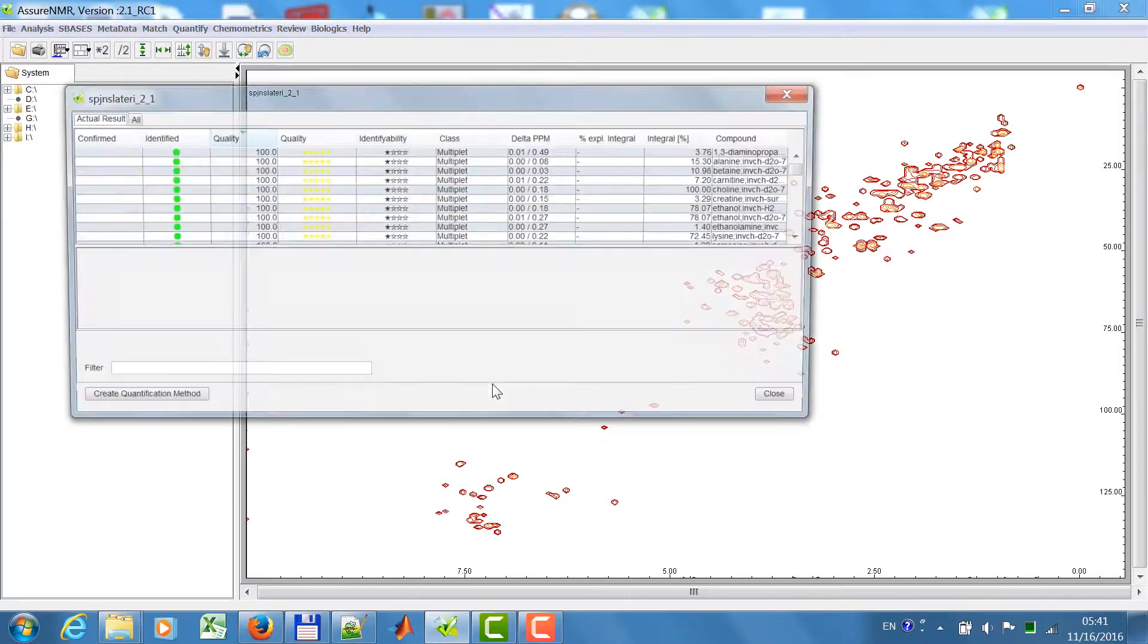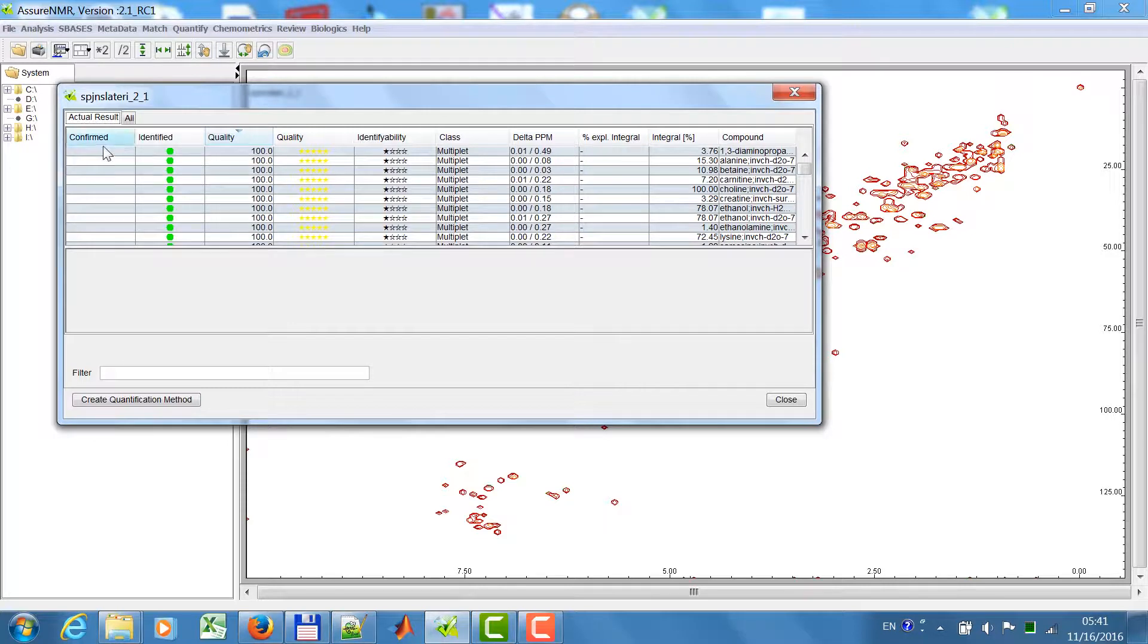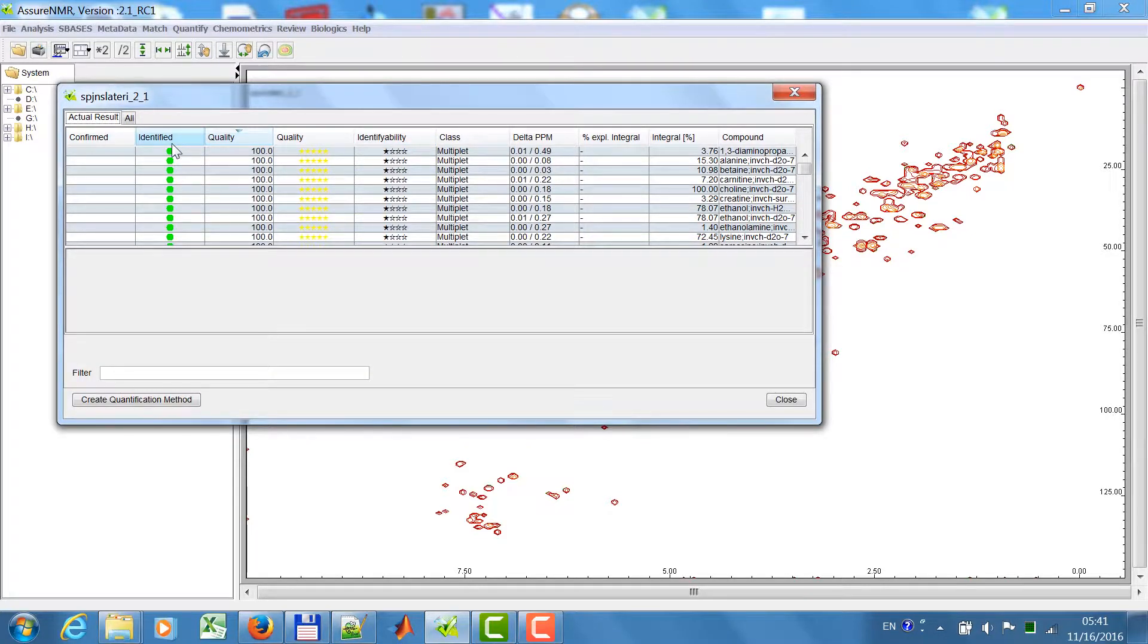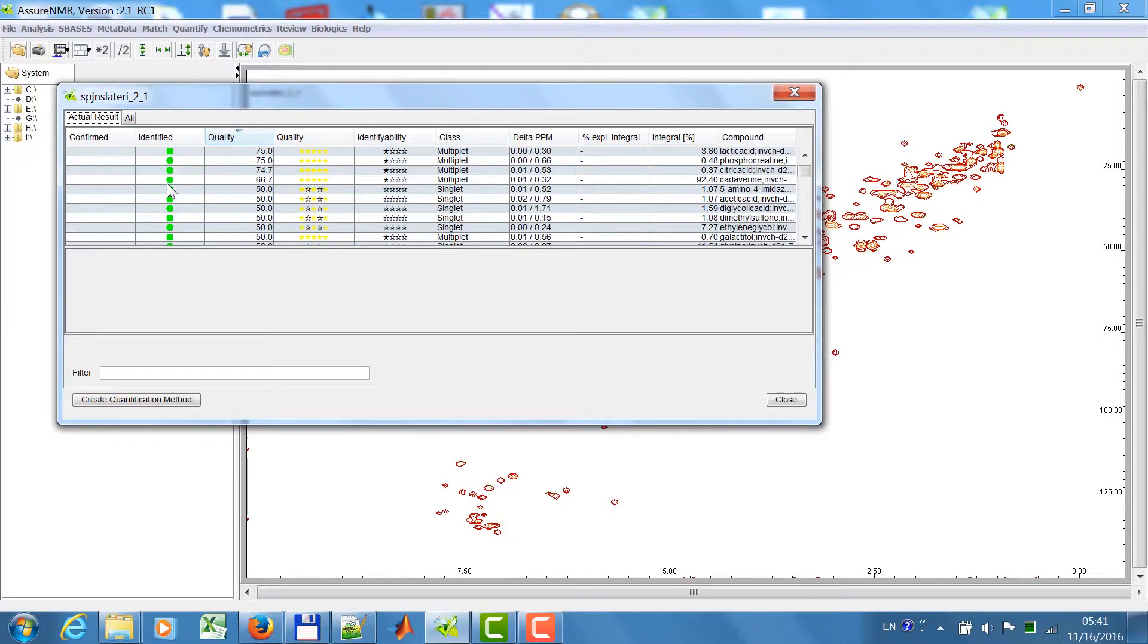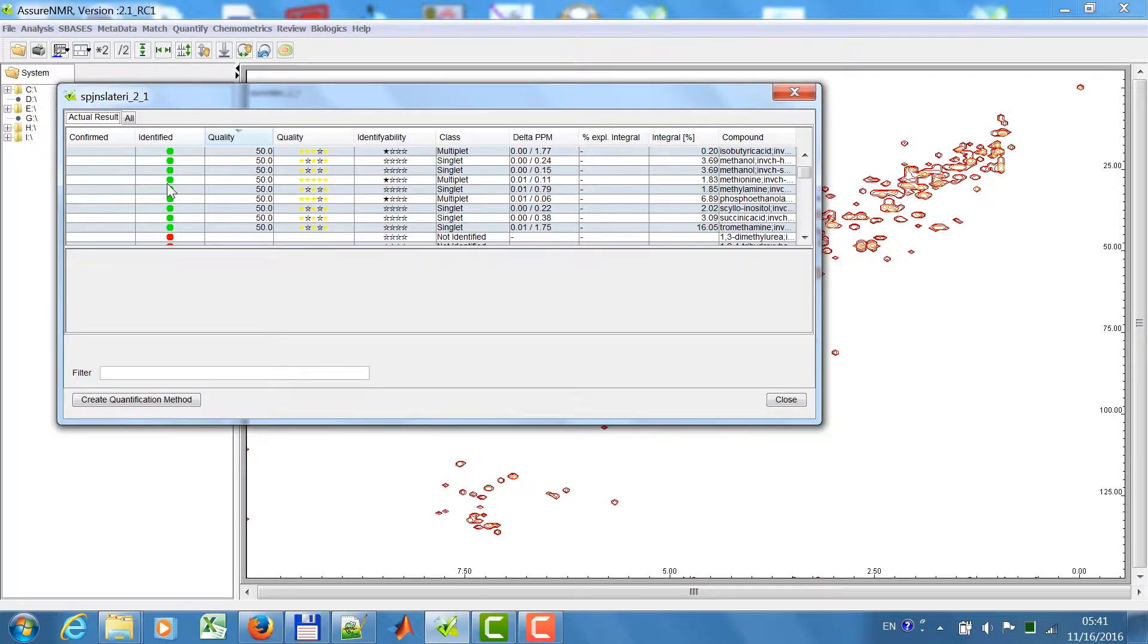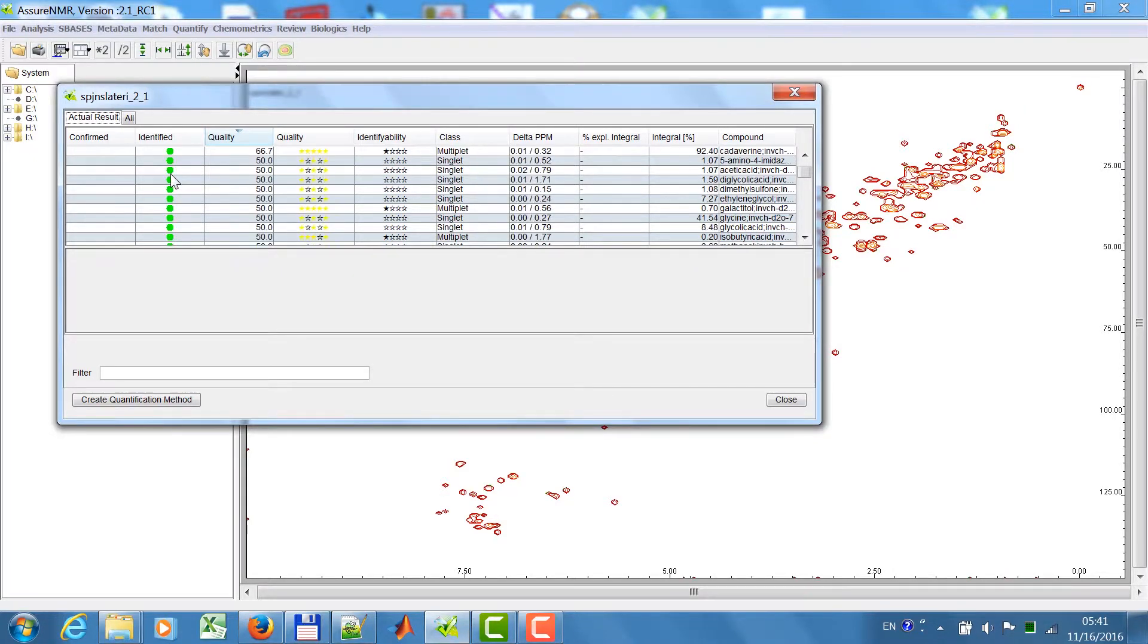After the match is finished, the result is displayed here in the panel. In the table you will find an overview of all the compounds. You have a column called identified with green balls if the compound was identified, and red if it was not identified.